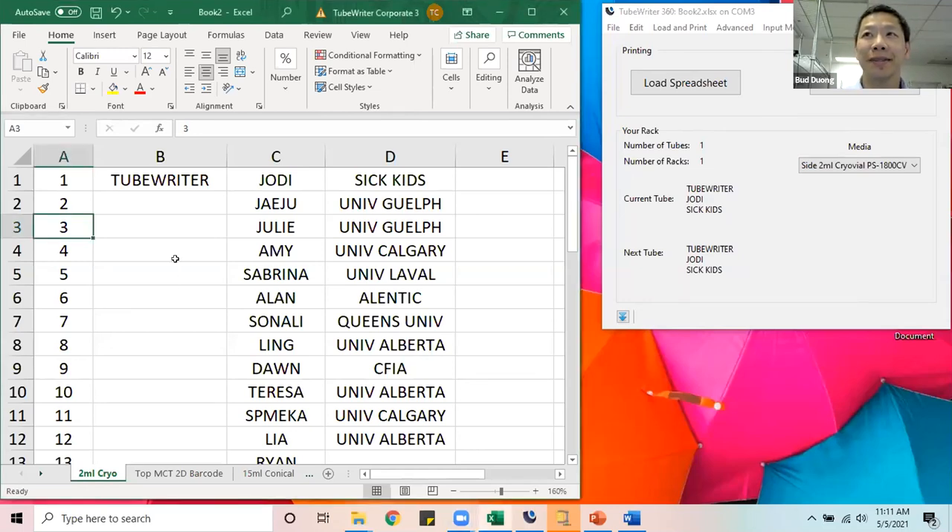Can you see the Excel spreadsheet? The Excel spreadsheet is very straightforward — just your native Excel, no add-ins or macros. Column A simply represents the print position in the rack you'd like to print. Every row is a separate tube and every column is a printing line on the tube. So B1 is the first printing line of the first tube, C1 is the second printing line of the first tube, and D1 is the third printing line of the first tube.